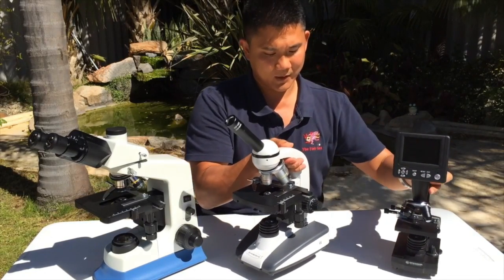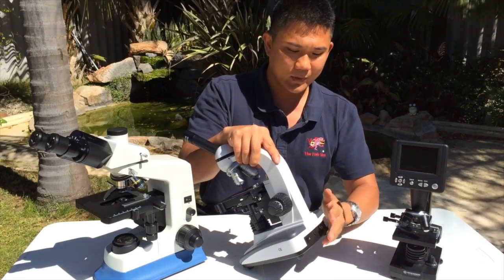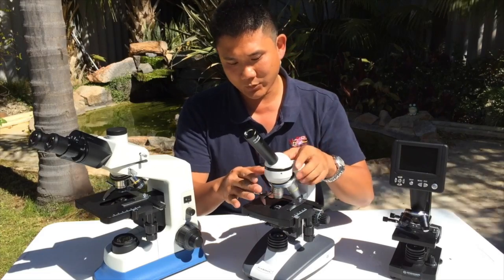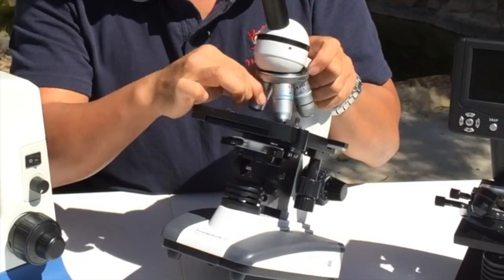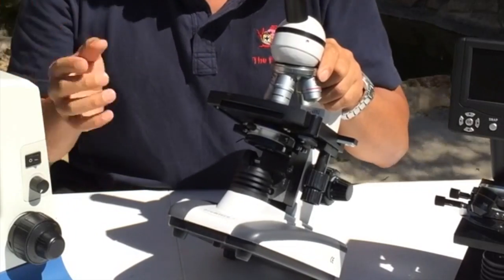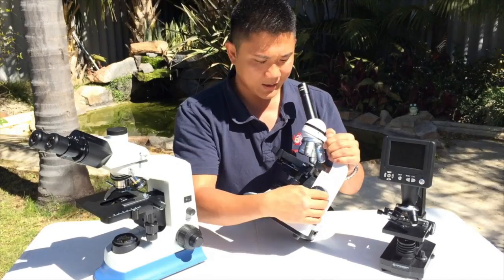Next we're going to talk about this microscope. This is a monocular microscope because it's only got one eyepiece — it's the exact same model I use in the field. It's got a power source through the power point plus a rechargeable battery inside, so when using it in the field you don't have to deal with dangerous electrical cables around or near water. The nosepiece has an additional objective: the standard 4x, 10x, and 40x, but also 100x. The 100x is mainly used to look for bacteria, but for home aquarists all you need is 4x, 10x, and 40x. The stage control knobs and focus are operable with just one hand, with coarse control and fine focus. It also has a swivel head.